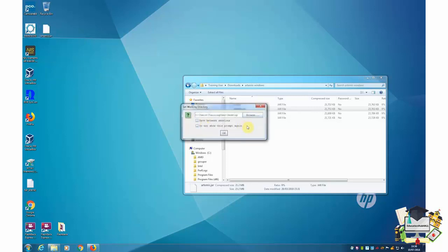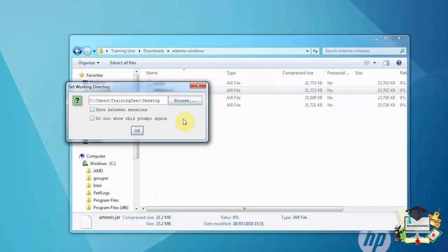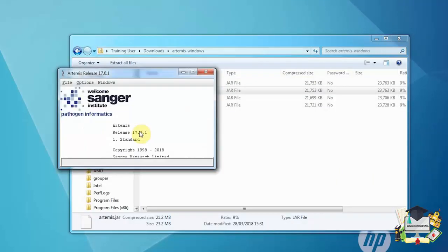First thing we need to do is set up our working directory. I'll leave this as the desktop. We now have the initial Artemis window. Having installed this on a Windows PC, we will now install the software on a Mac.